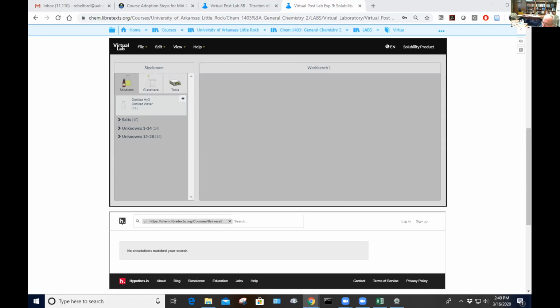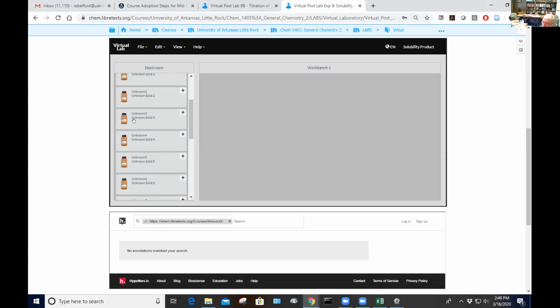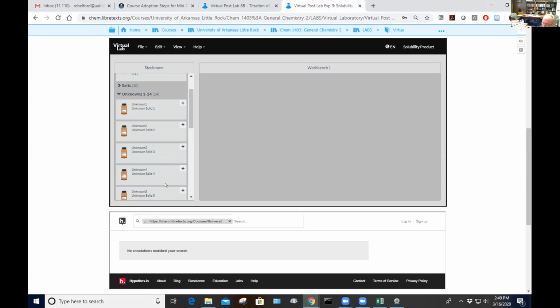But on the unknowns, I do have the keys for them, but each lab has a different number of unknowns and we permute them. Now, if you can do it with your random thing, that's better. As Dave can testify, I think most of these are about a decade old, aren't they? Yeah, they were ported to HTML5, but the design of them goes back a ways.